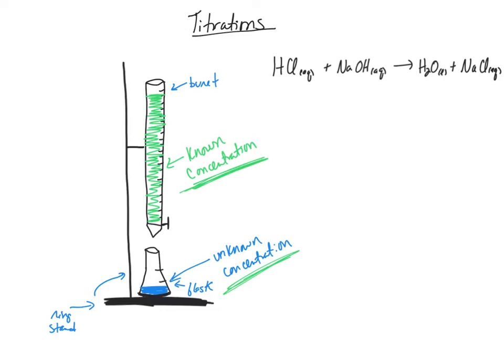This particular titration, I'm going to give as an example, is a titration between HCl and NaOH. Now, this is a typical acid-base titration and what you usually start with when you're doing a titration lab. So here we have a strong acid that mixes with a strong base, and it gives you water and a salt, so it's rather innocuous.